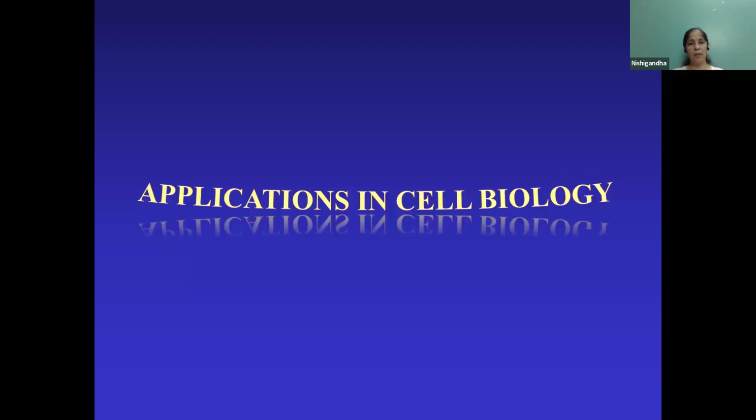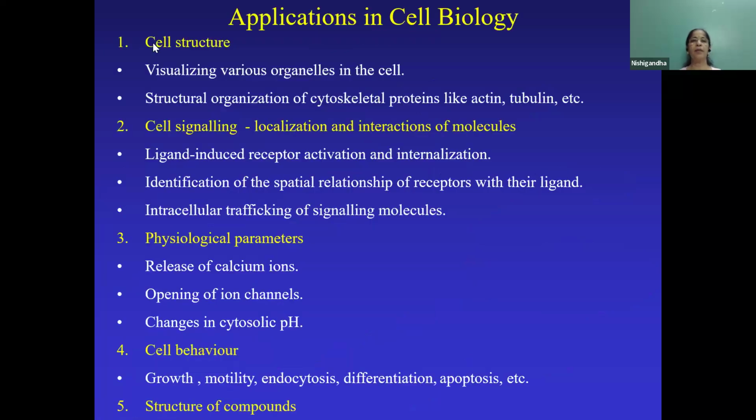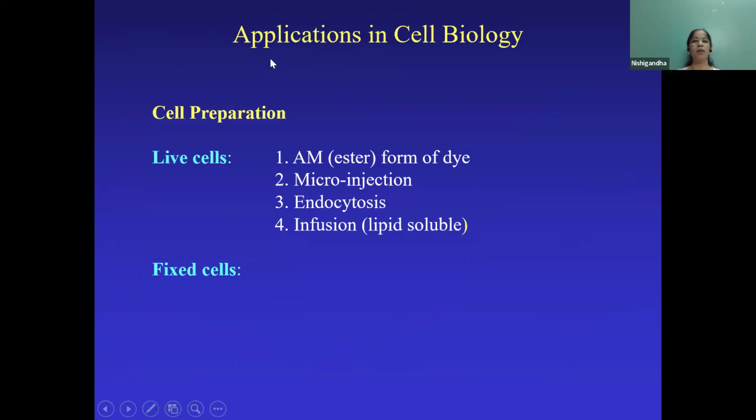So where this technology can be applied. I'll give you a few examples by giving images and just run through various applications that we can have. Say if we are talking of the cell biology or zoology, any life sciences, then we can look at different cell structures. We can also look at various compounds. We can look at drug uptake, physiological responses of the cell, like cell motility, cell cycle, then molecular interaction, diffusion of molecules, co-localization, cell signaling. So what I'll do is I'll just give you few examples of this. I'm not running through because anyway this will be covered.